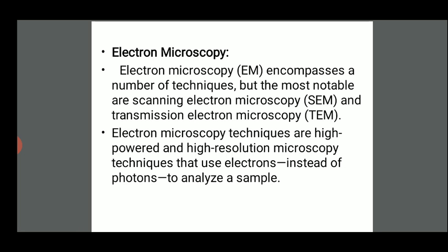The electron microscope techniques have become some of the most widely used microscopy techniques. Along with atomic force microscopy, these electron microscope techniques have become most widely used, especially for imaging and analyzing where nanomaterial is concerned.